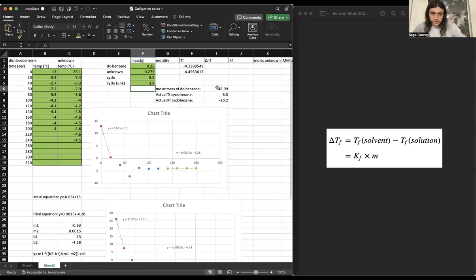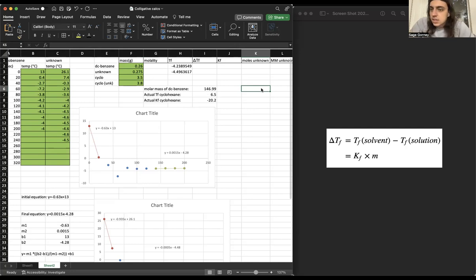Now, let's fill in the rest of this table. We can start with molality. I would like to suggest, to make your life a bit easier, maybe converting to moles separately over here. So we're going to do our moles of solutes. And here we can do DC benzene. Maybe make yours not as cramped as mine is. And, oh, you only need it for dichlorobenzene.